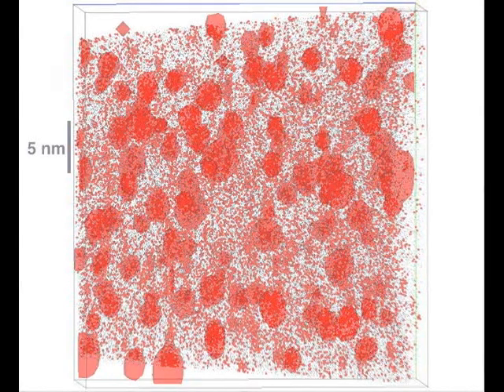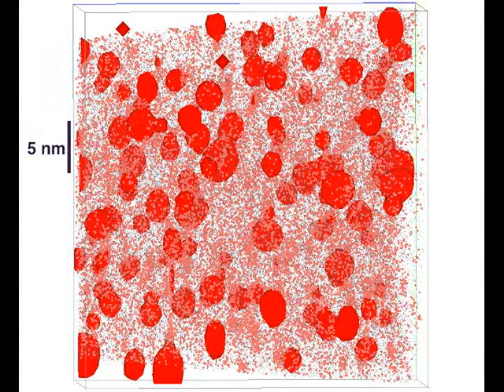The larger atoms are copper, shown in red. They're clustered. We can draw surfaces around those to show where these precipitates of copper show up.